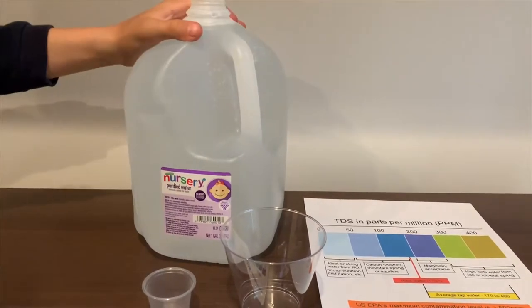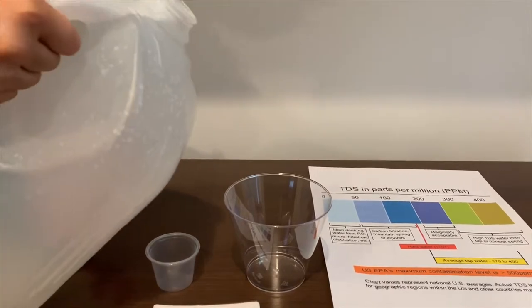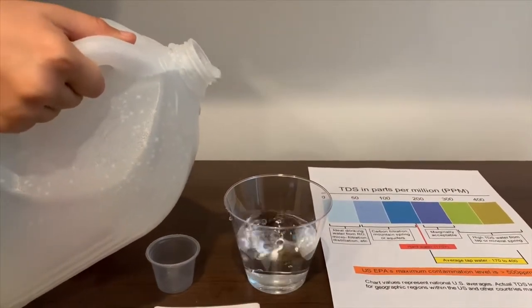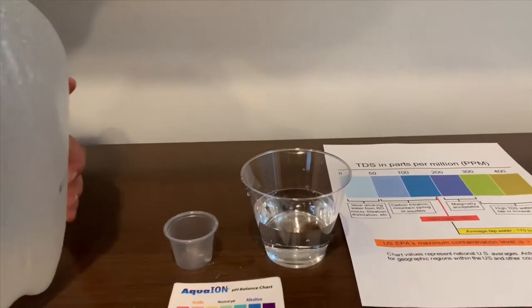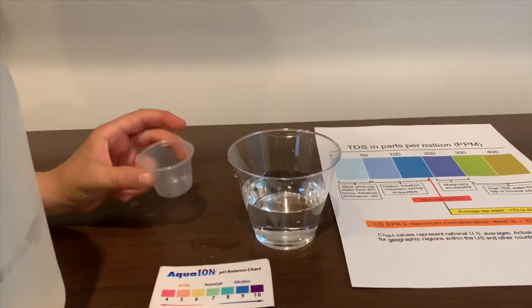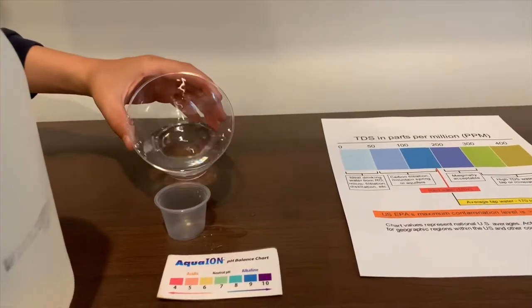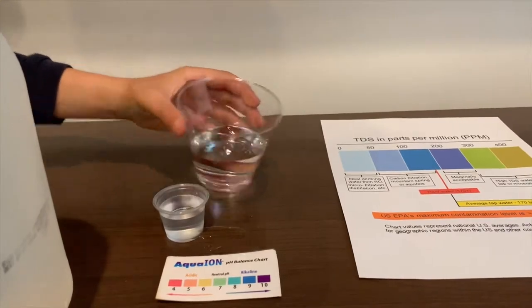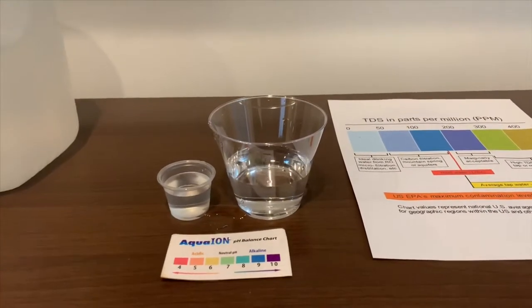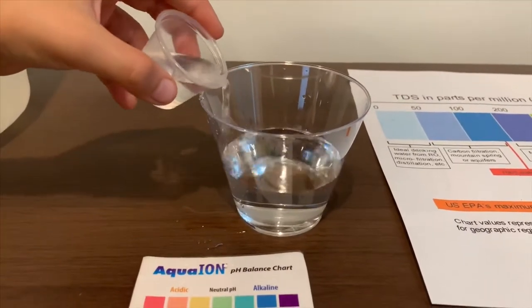Let's open it up and pour some water in. This is a little too big to pour inside directly, so I'm going to use this to pour inside. This is a little too much, so let's pour some back in.